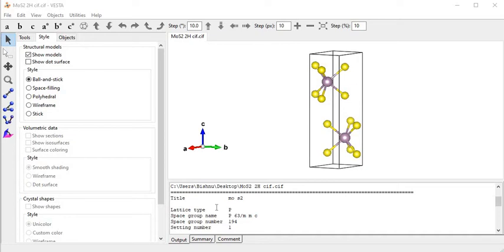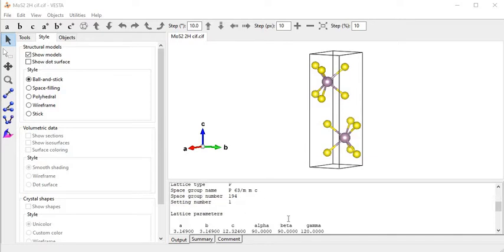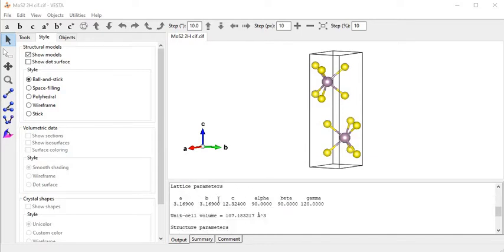Hi everyone, today in this tutorial I will show you the features of VESTA software. On screen we see the MoS2 crystal structure with lattice type P and space group P63/mmc, space group number 194. The lattice parameters are: a equal to b equal to 3.16, c equal to 12.32, alpha equal to beta equal to 90 degrees, and gamma equal to 120 degrees. This crystal structure is hexagonal.